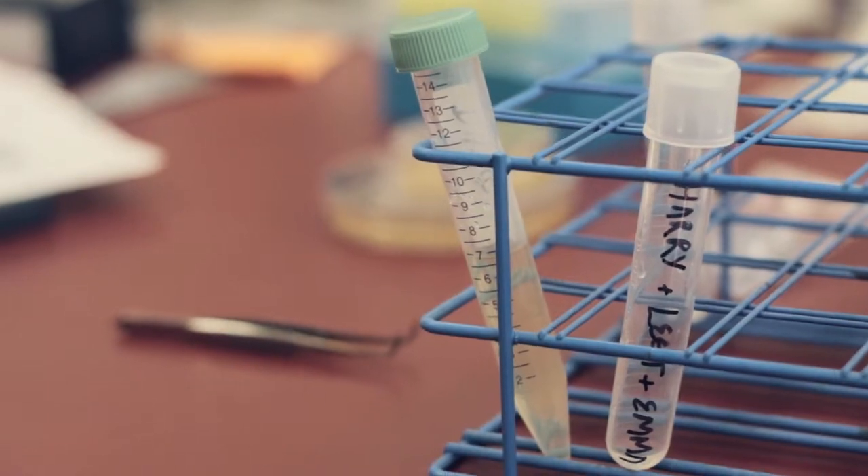Then we're going to move on to bioluminescence and we're testing different plasmids and seeing the differences between them, and hopefully by the end of project week we're going to try and design our own plasmid.